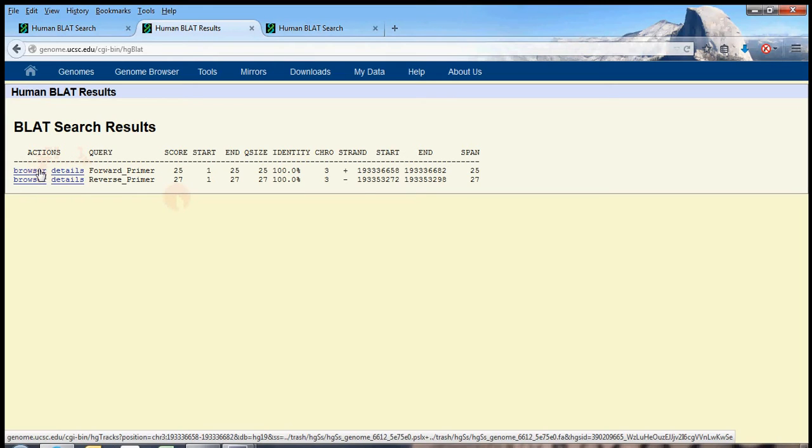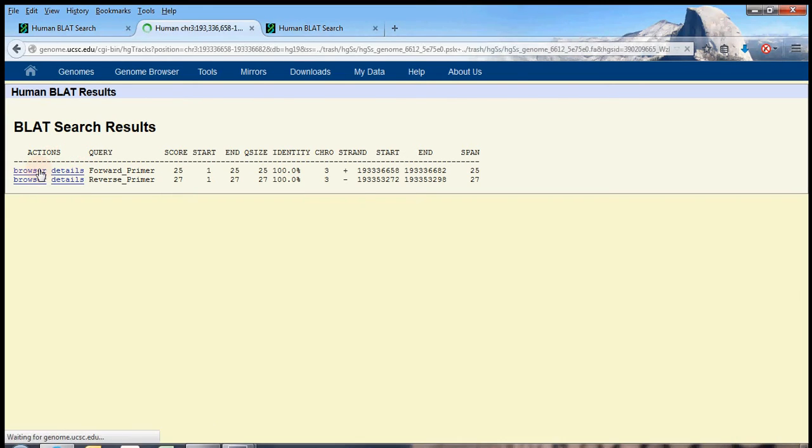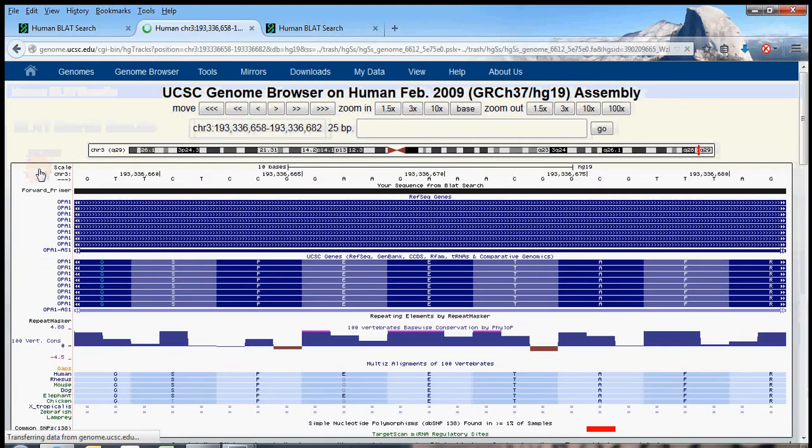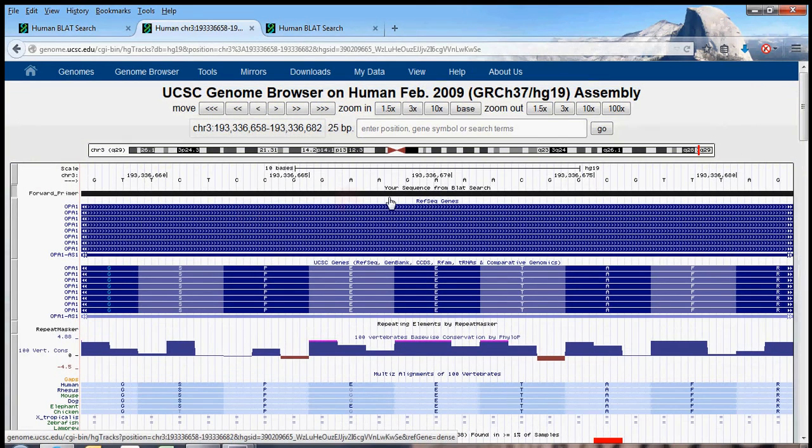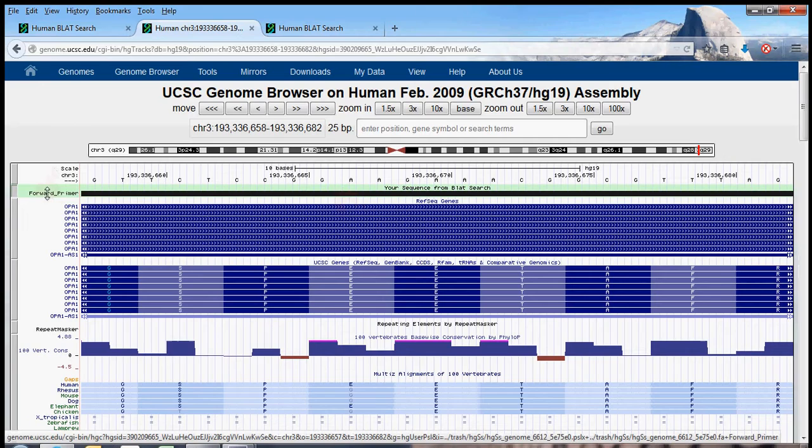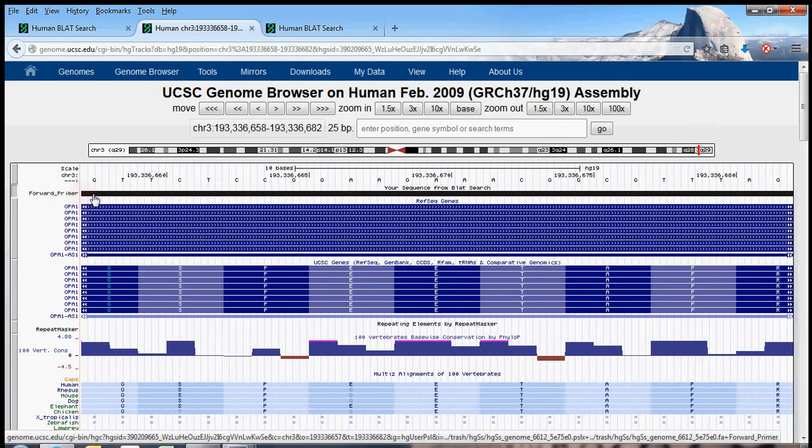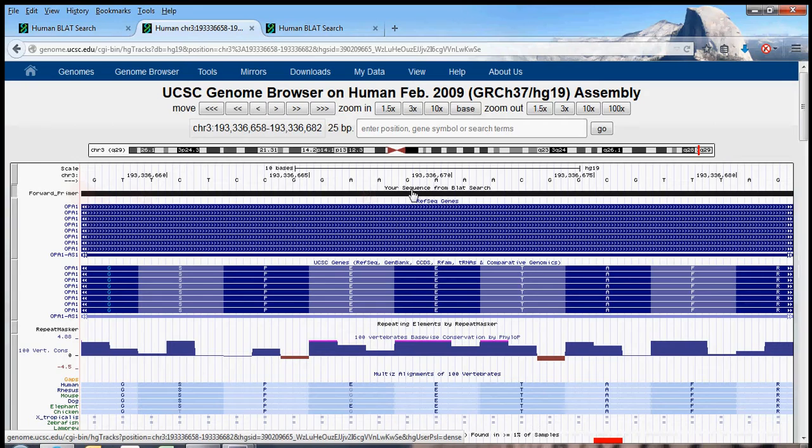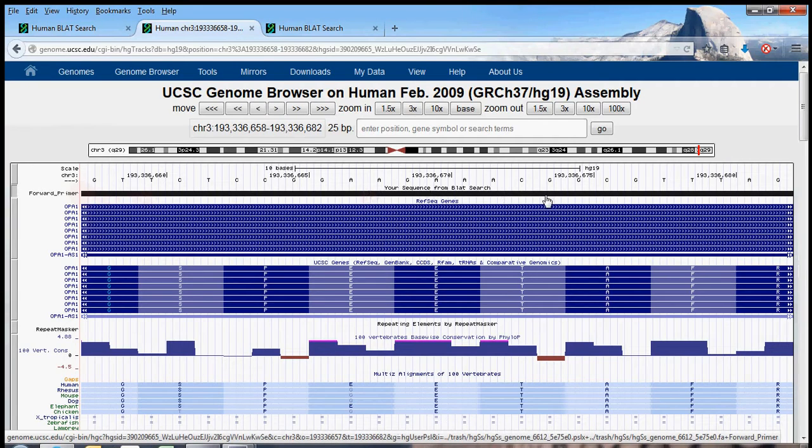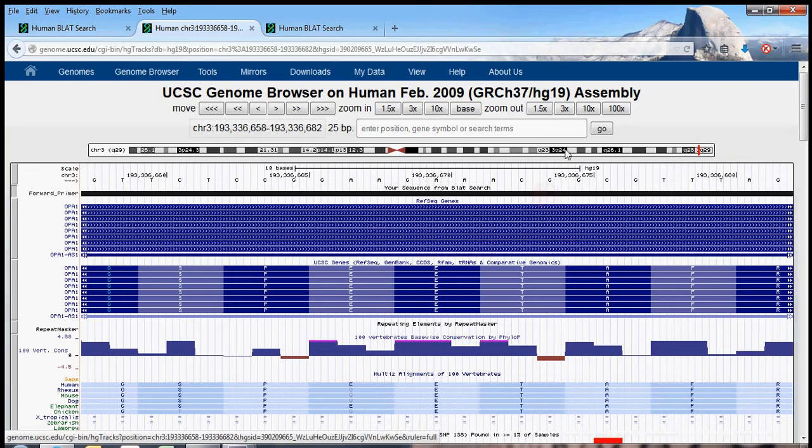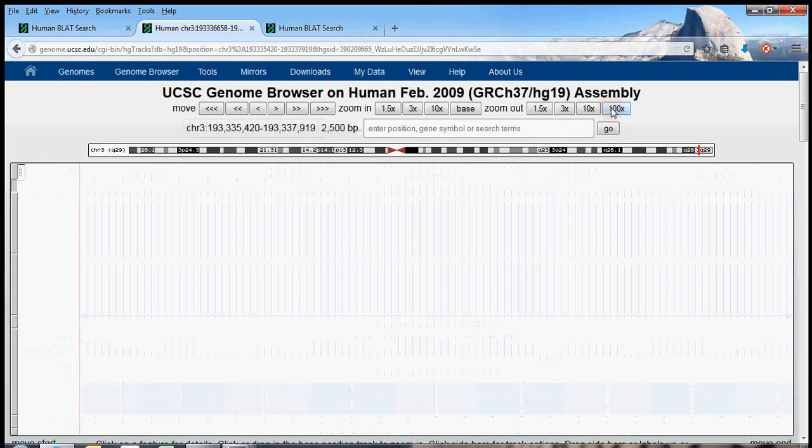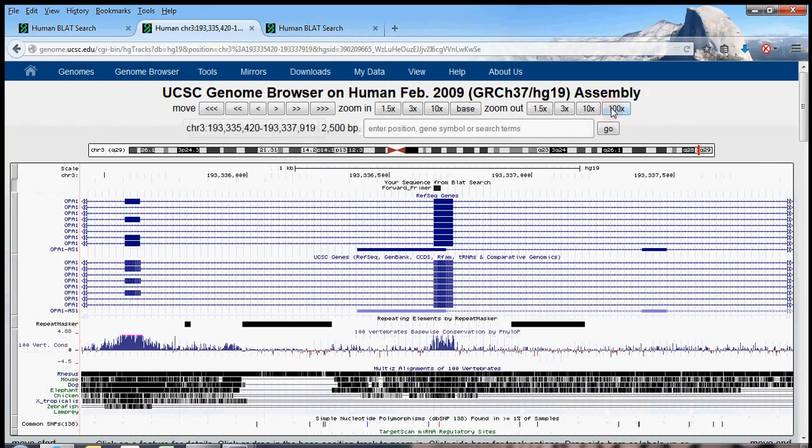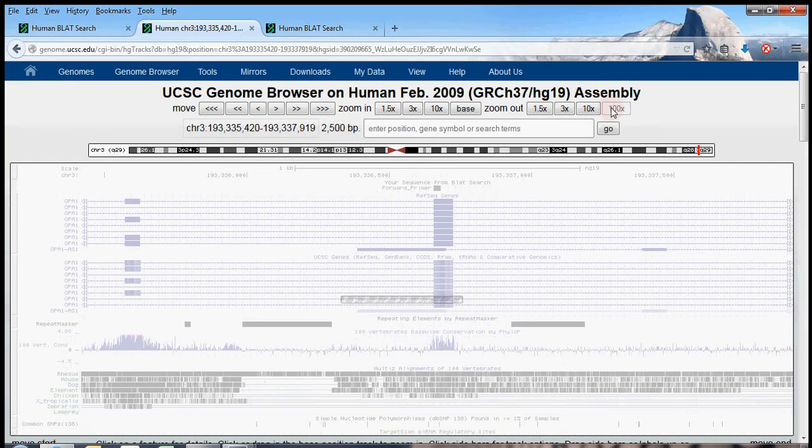But just to make sure that these primers land where we want them to land, we can actually go over to the genome browser from this link, and we're back to our familiar genome browser. So we're just looking at the forward primer now on BLAT. The forward primer is indicated by this black box. But we obviously can't see the reverse primer, because it's pretty far away. So why don't we zoom out 100 times?